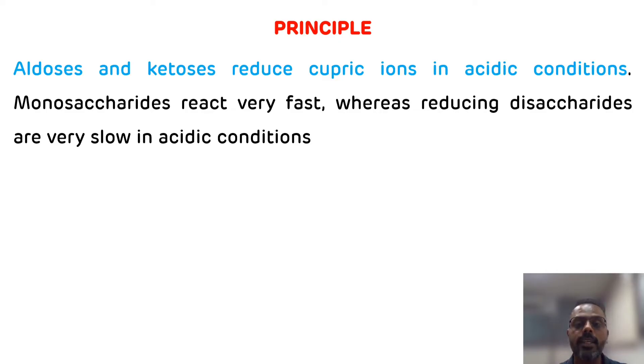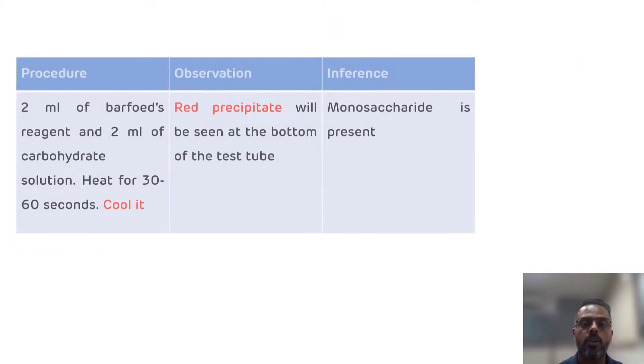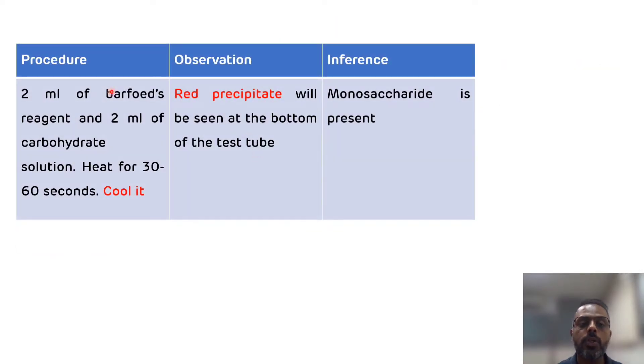Now we will see the procedure, observation, and inference of Barford's test. In the test tube, take 2 ml of Barford's reagent, which consists of cupric acetate and glacial acetic acid. In the same test tube, add 2 ml of carbohydrate or given solution, then mix it properly.